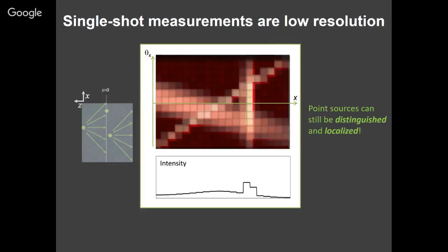And we don't, because we're treating these neurons like point sources. I just want to know if the thing is on or not, and know that it's this one and not the one next door. And neurons are big. They're much bigger than the diffraction limited resolution of our setup.